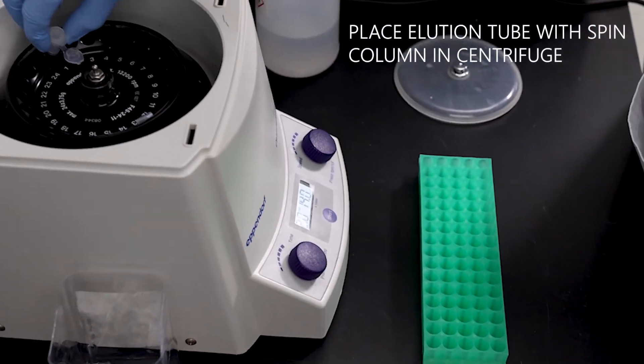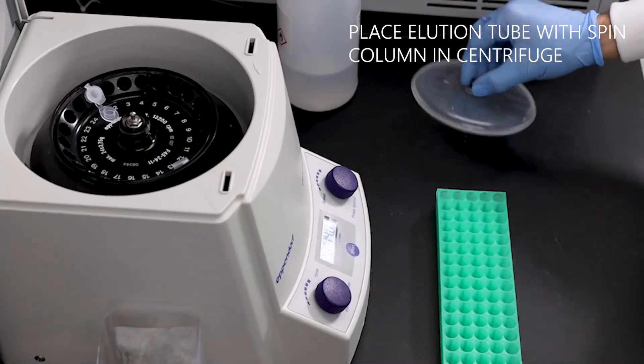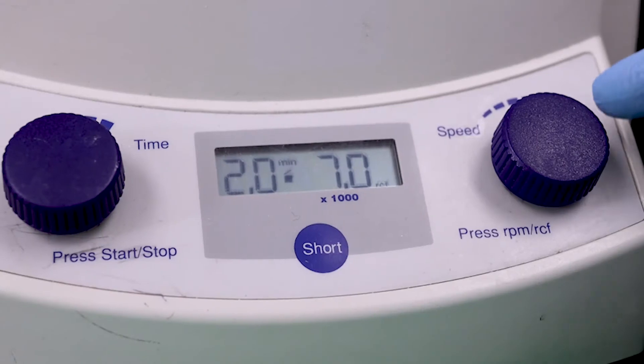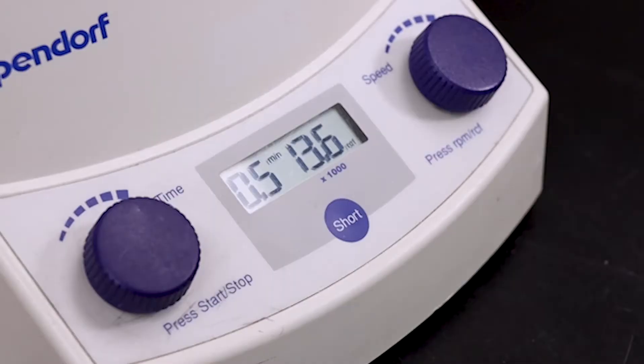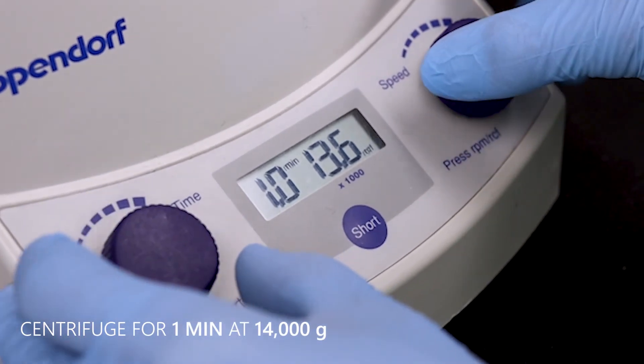Then place the Elution tube with the spin column in a centrifuge. Centrifuge for 2 minutes at 2,000 G. Then centrifuge for 1 minute at 14,000 G.